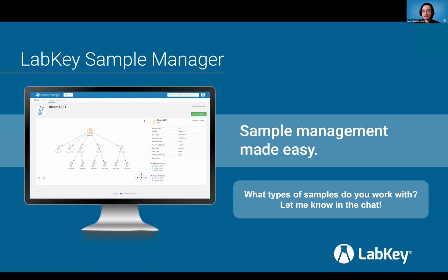And that makes me really excited about Sample Manager because I can see how we can help labs coming from these different systems and improve sample management in major ways. So today we'll briefly discuss what to consider when looking at a sample management system, who LabKey is as an organization, and we'll dive into a demo of Sample Manager.